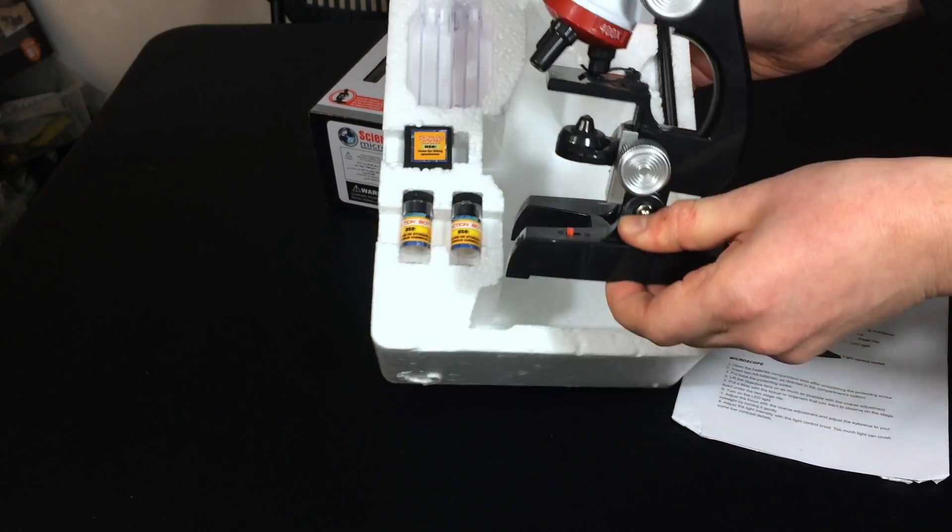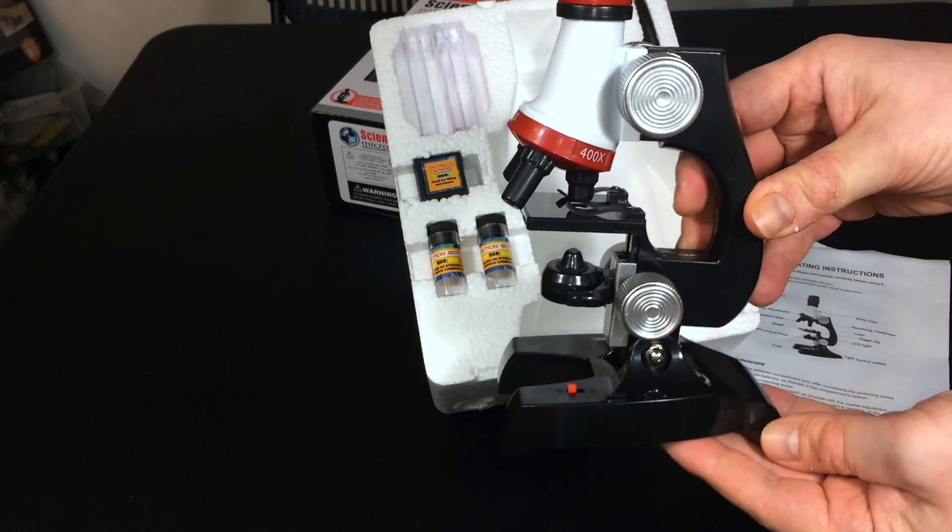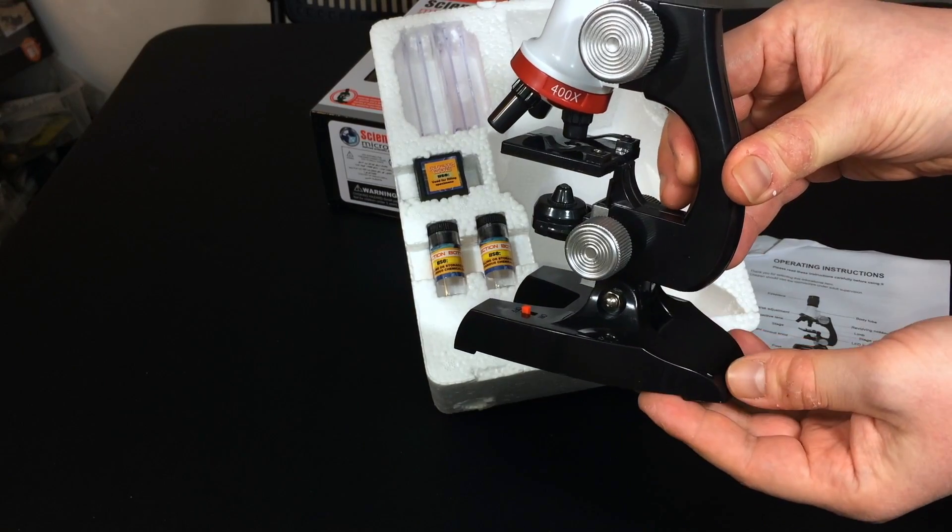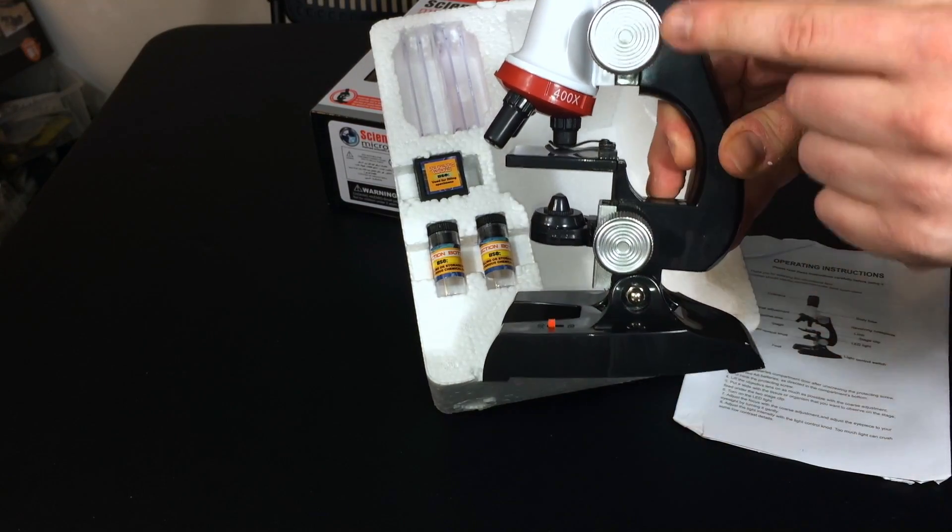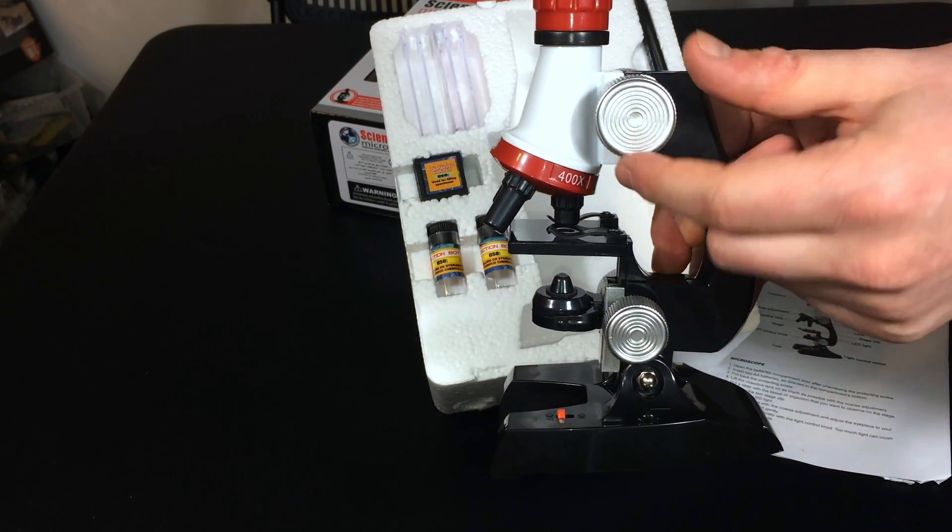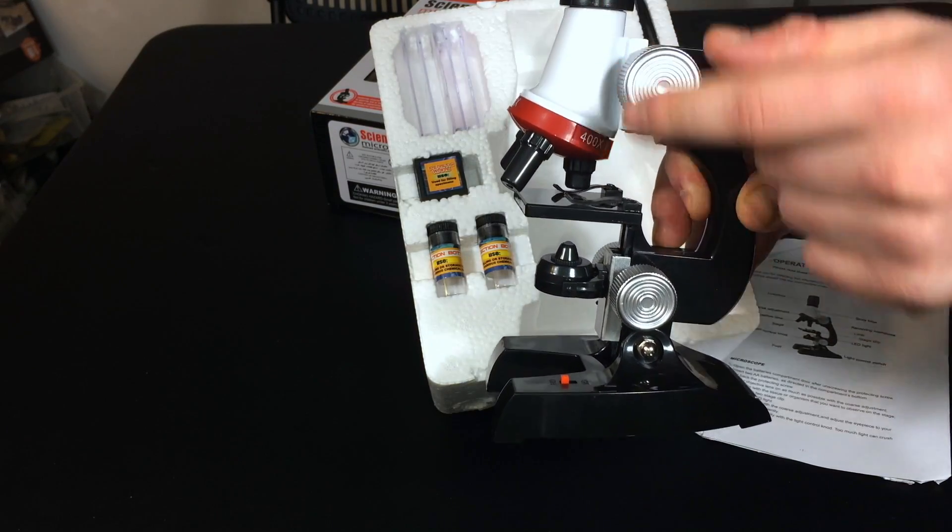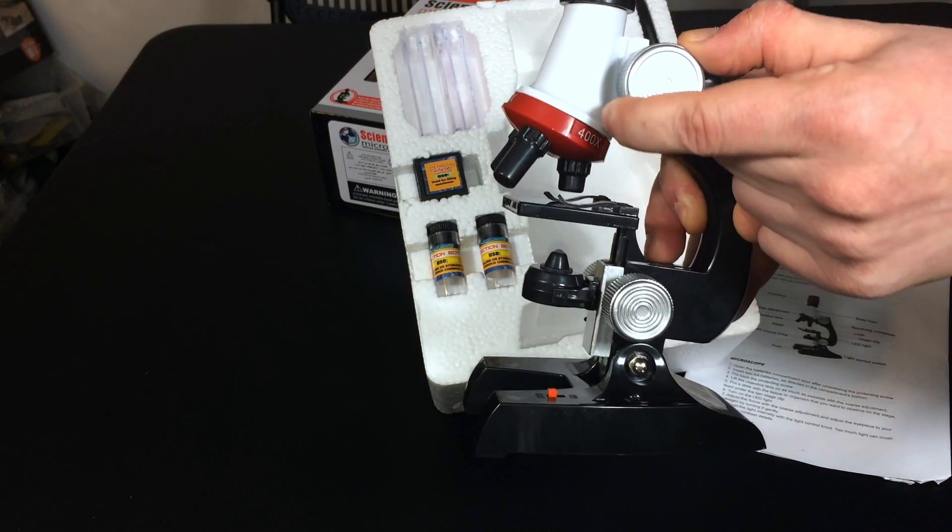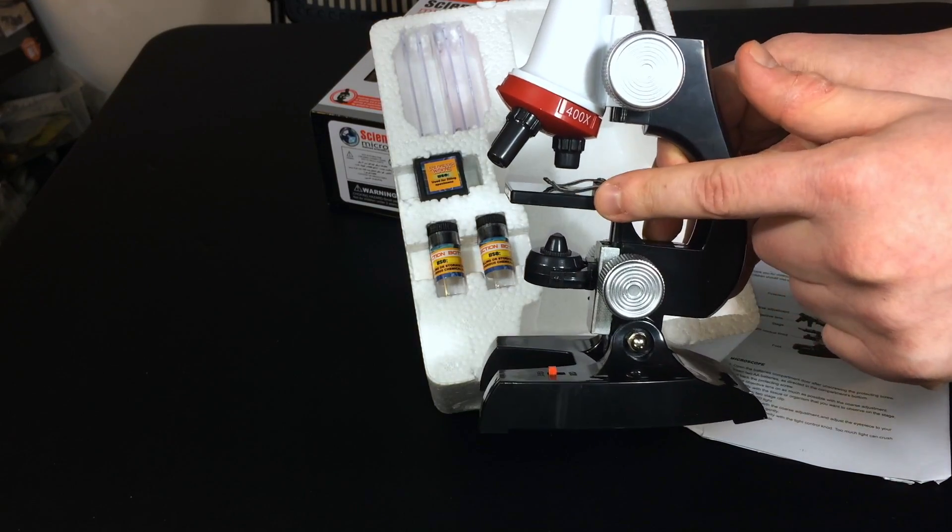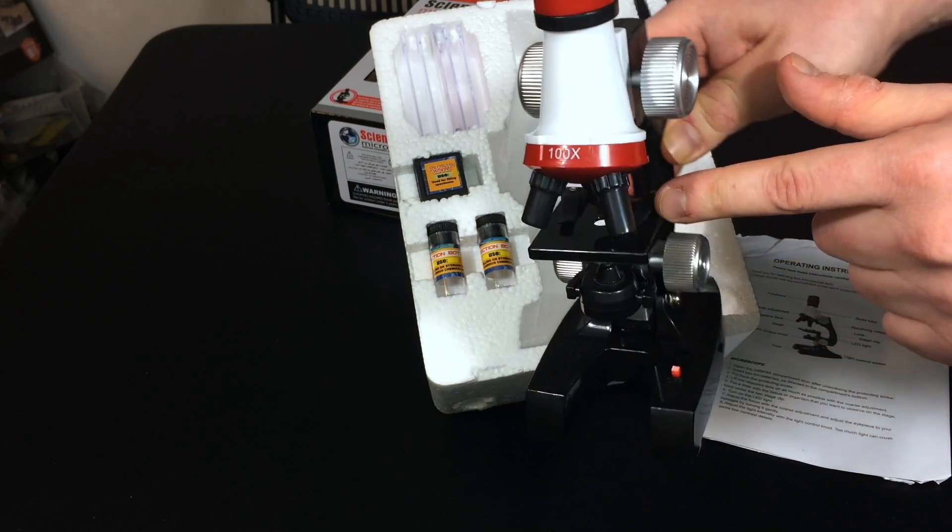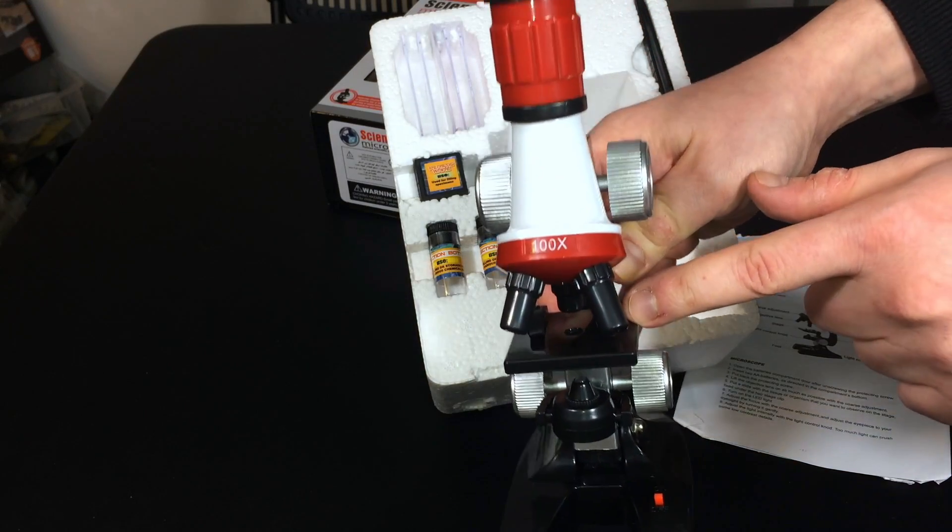Okay, it's packaged pretty well. And here's the actual microscope itself. So you have the adjustment here and an adjustment here. This is the coarse adjustment, or rather the fine adjustment. So we can move the actual microscope lens piece up and down away from the diaphragm right here, which is where we will be putting in the slides under these two clips right here.